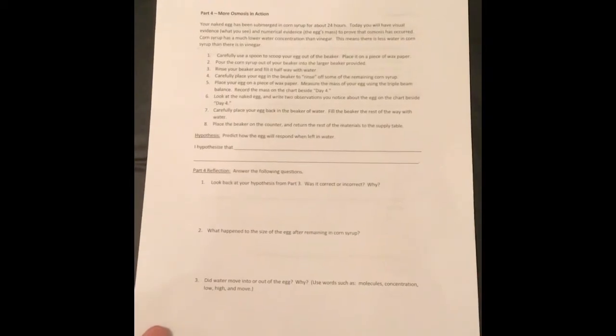Each part of the experiment is going to explain a different chemical being used, and then you're going to look at the effects of that chemical on the egg. So there's what you'll be doing for part two, and then it'll move on until part three. Again, we're studying diffusion and osmosis. Then part four, and finally, part five, which will be the final observations.